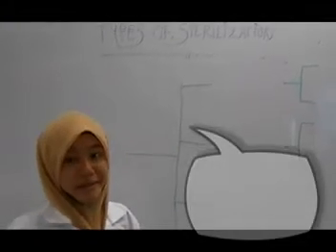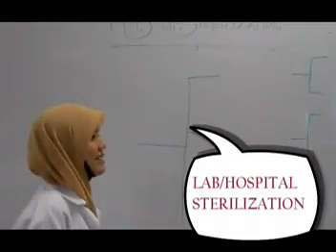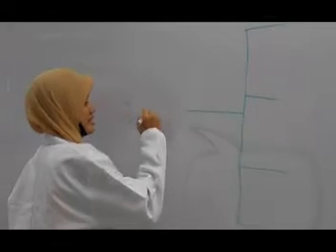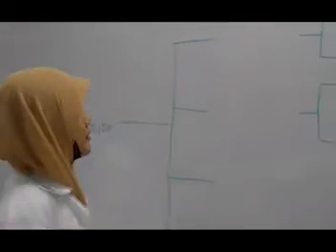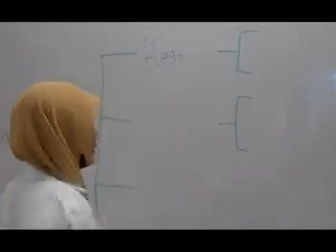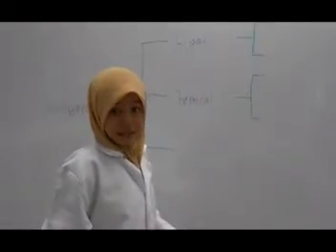I would like to explain about lab and hospital sterilization. Sterilization can be divided into 4. First, heat. Second, chemical. Third, radiation.